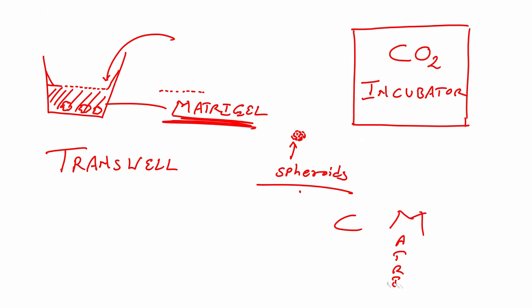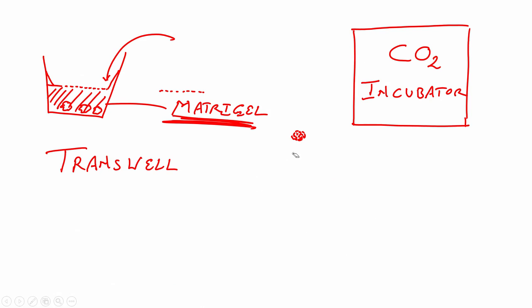So, what we are doing is, we are growing the cells within the CO2 incubator with the help of cell culture techniques, and then this growing of cells and clumping together forms a spheroid. This spheroid, I will take and load in a transwell, right. And this transwell has, along with the spheroids, a matrigel. Alright, this much is easy.